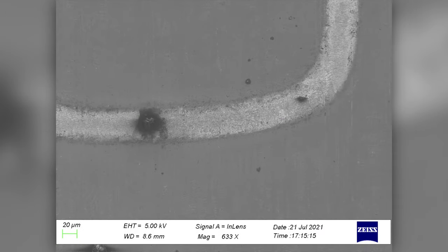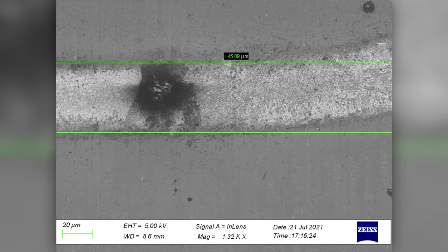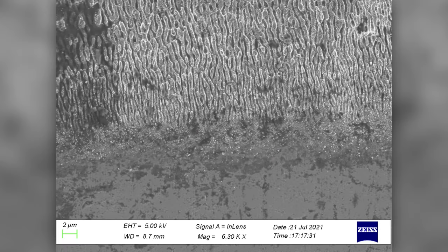Here is the largest I — half a millimeter in thickness. We are approaching the lower edge of the letter, and the magnification is already 1500x. It's time to look at how thick the trace from the laser is — only 40 micrometers. Even closer, and now we've increased it to 6300x. That's the answer to our question at the beginning of the video.